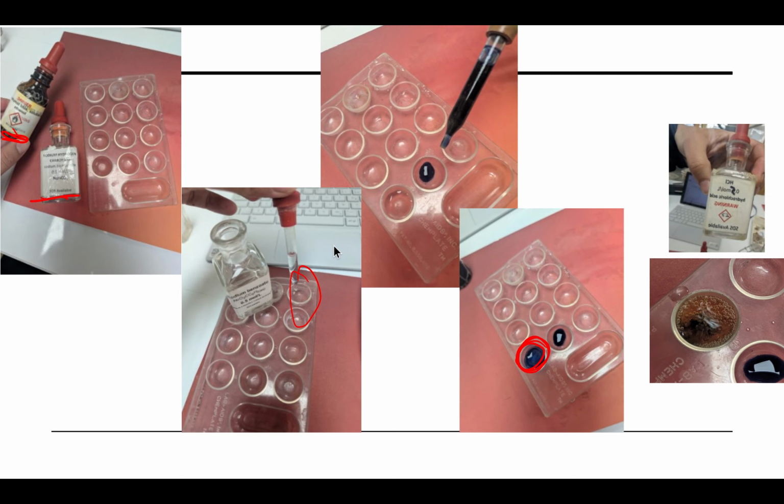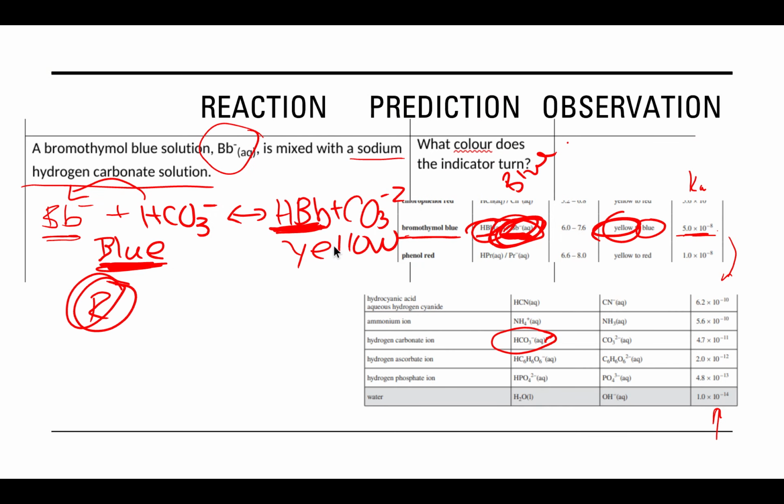And now I just wanted to show that, just because that blue is very overpowering, that the indicator was there. And if I took, and this flipped it, but this is HCl. So if I did take that acid and add it right into this well, you will see that it is turning yellow. And that's just because I am shifting and creating more of an acid in that reaction, making that yellow color.